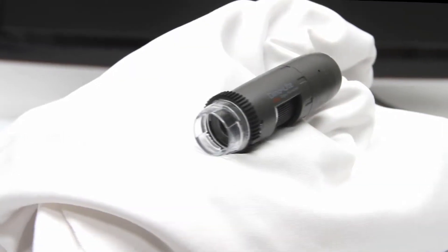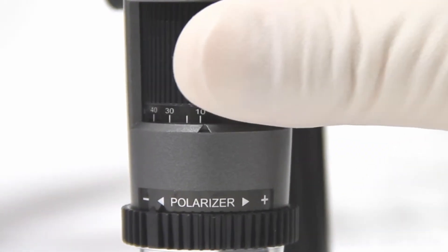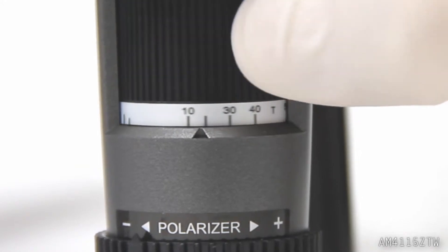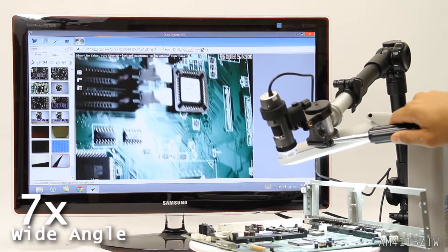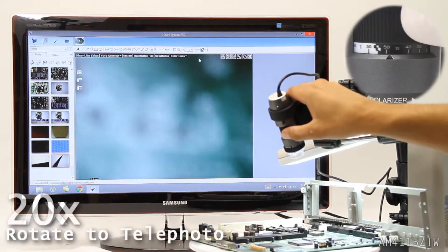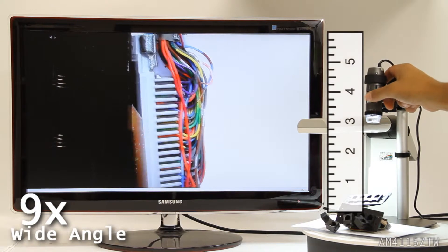Introducing the AM4115ZTW Dynolite Edge handheld digital microscope camera. This model has the Edge series sensor, polarizer, longer working distance, and dual magnification which offers a second optical zoom at most working distances. This allows users to easily and clearly see a wider field, then zoom into focus for more details at a higher magnification without changing the Dynolite height.